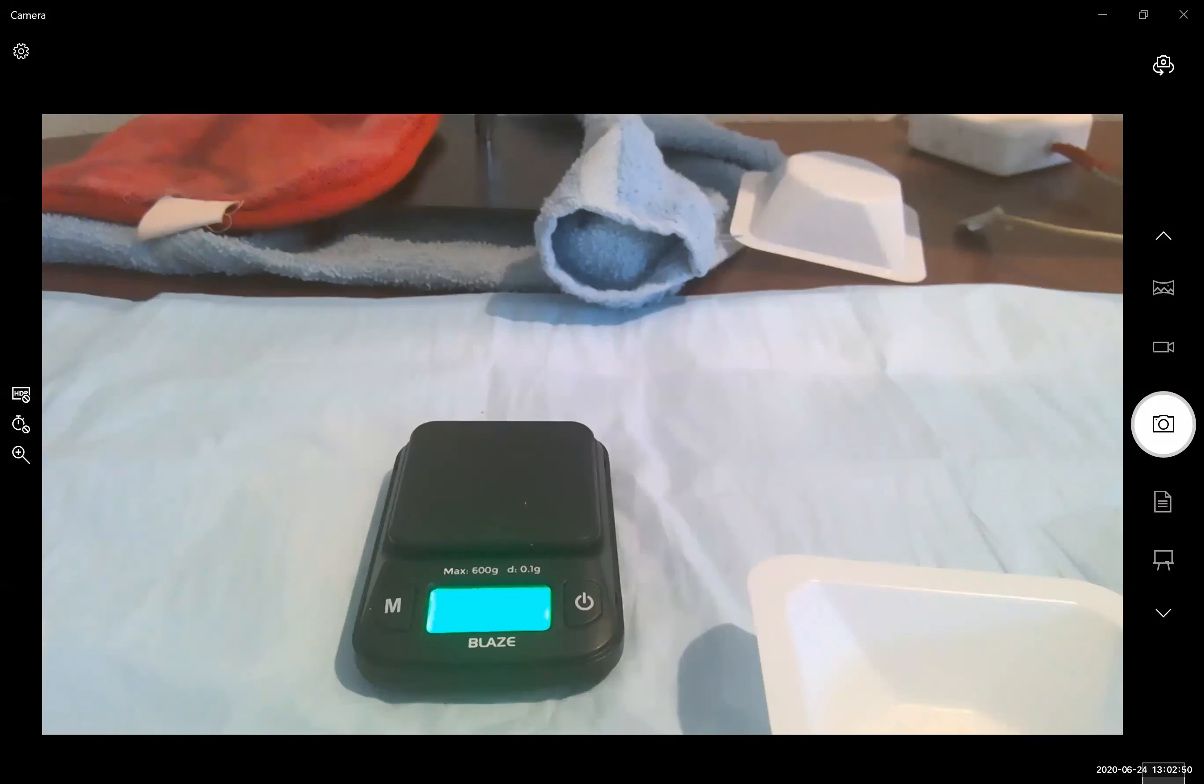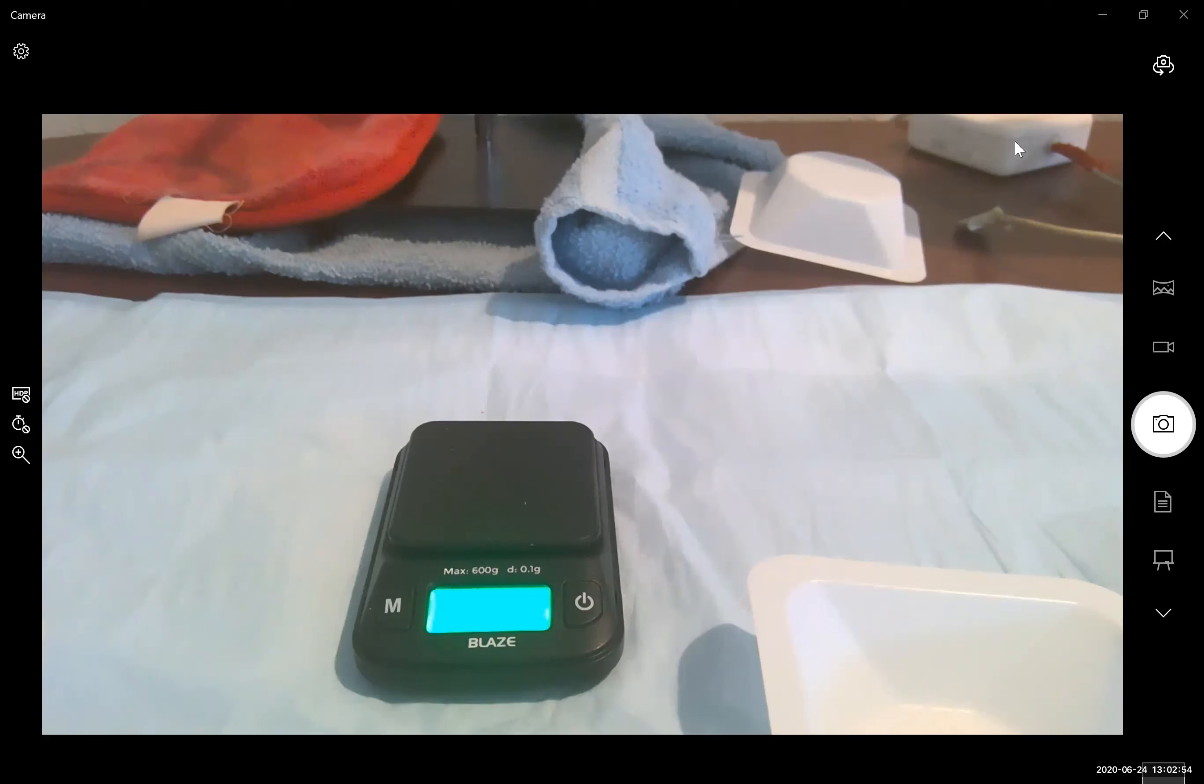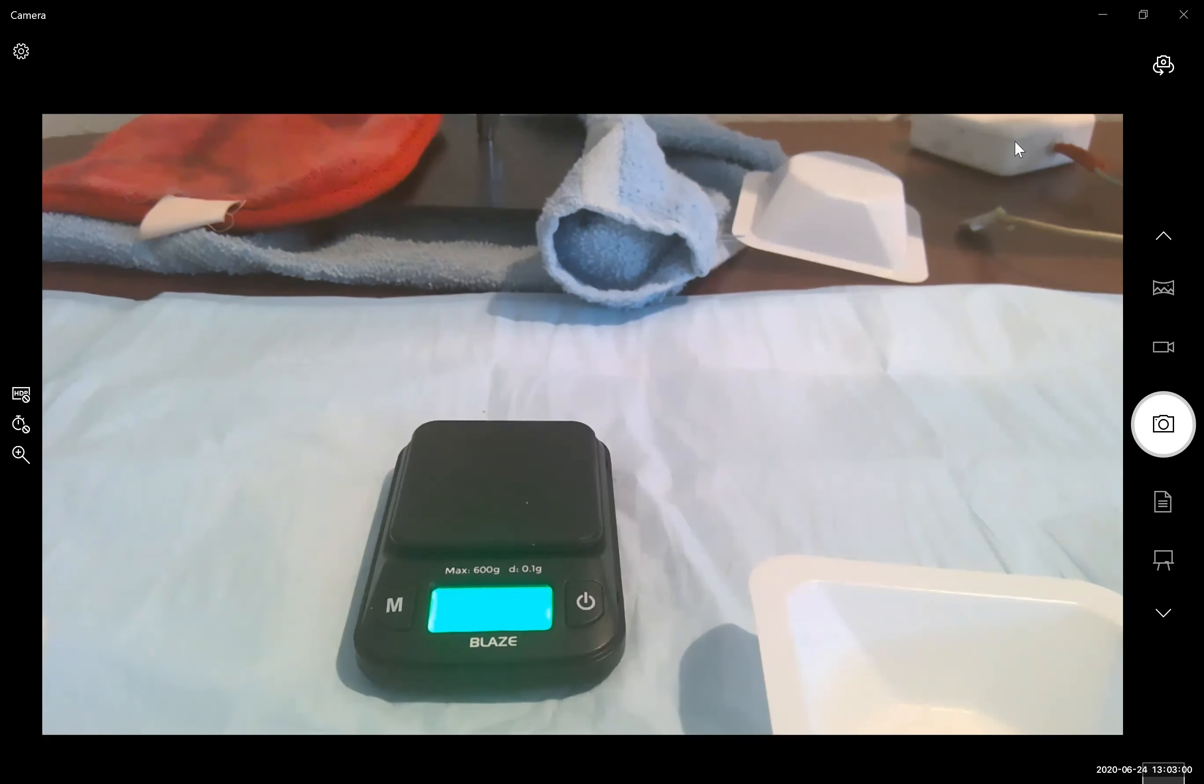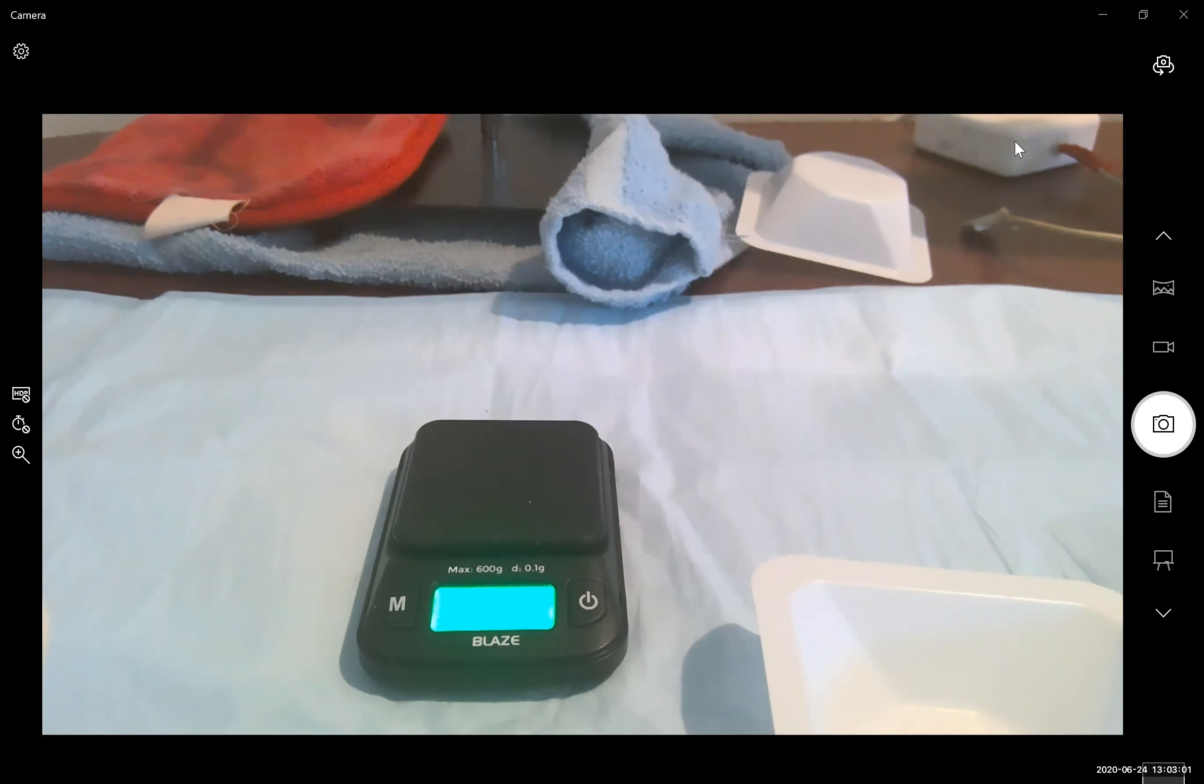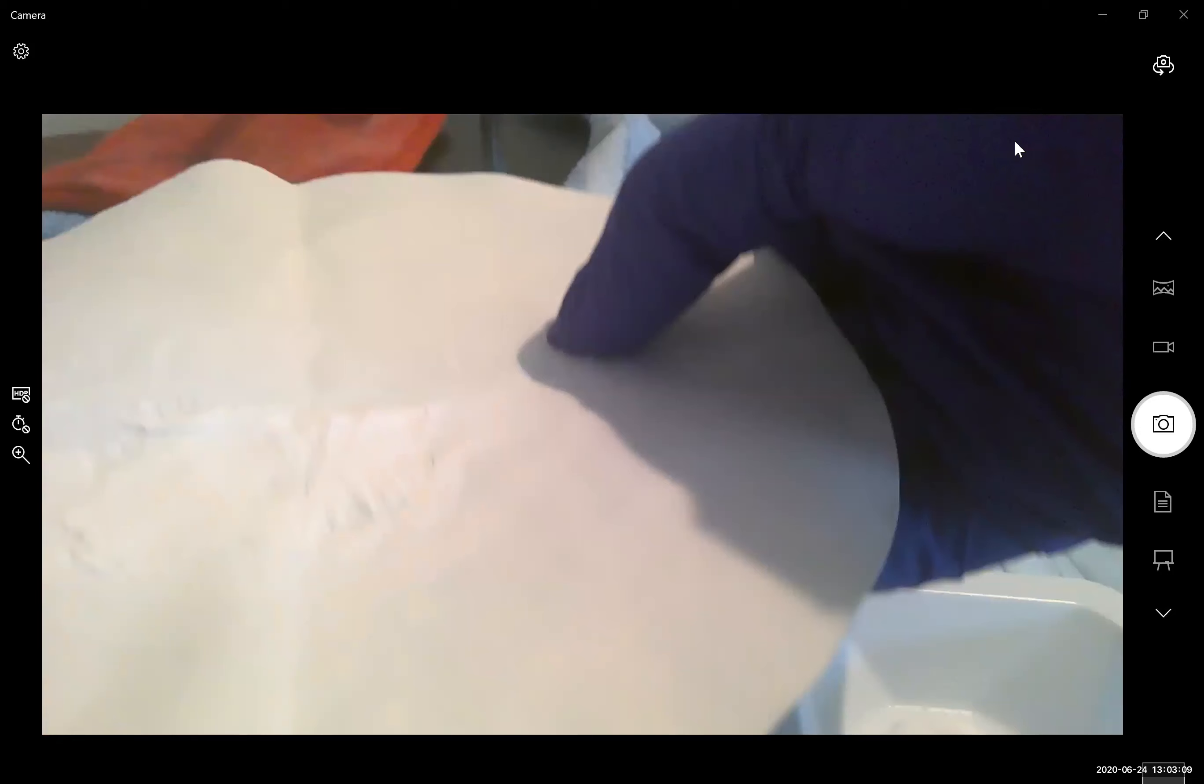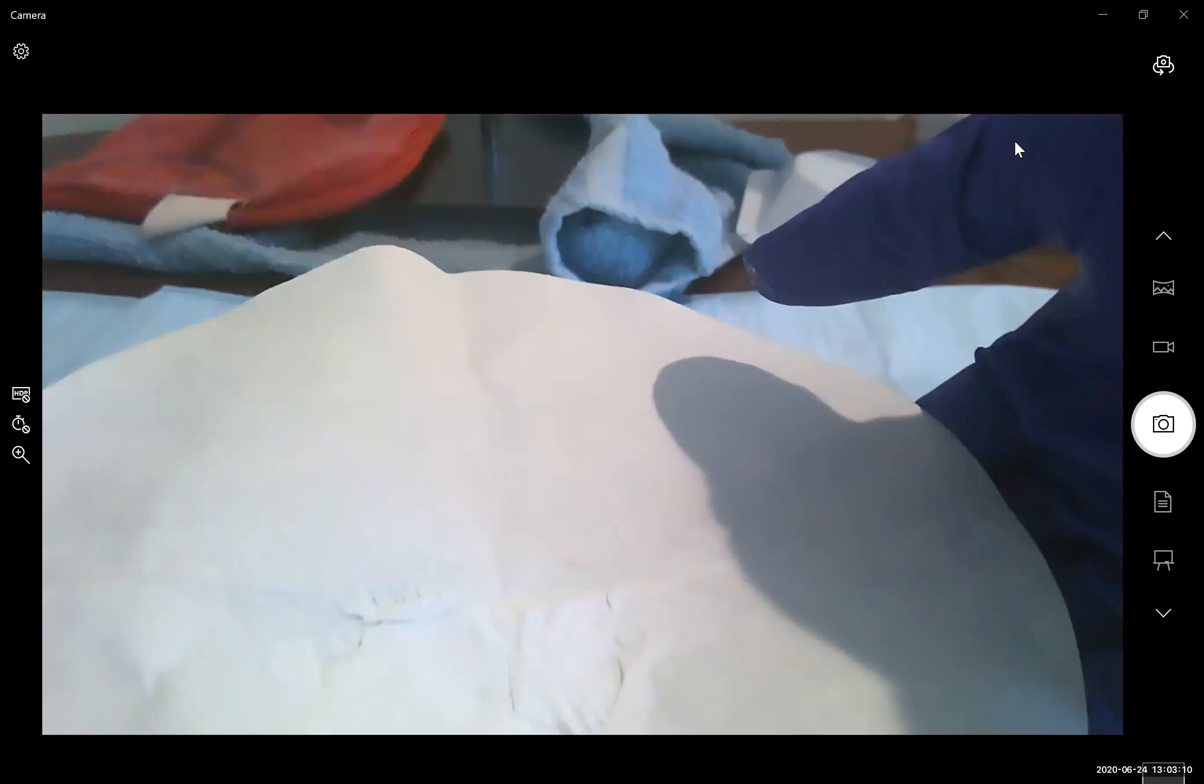Okay, so let's finish up our laboratory 11 which is gravimetric analysis. We have allowed our sample of calcium carbonate to dry fully.